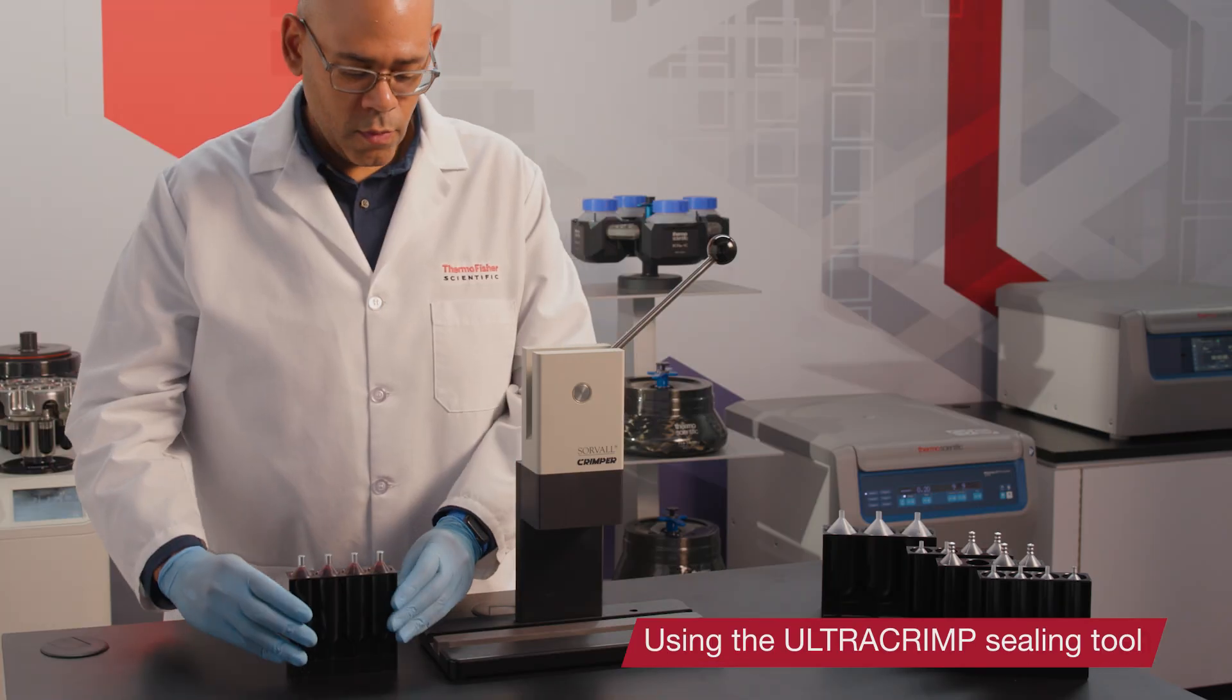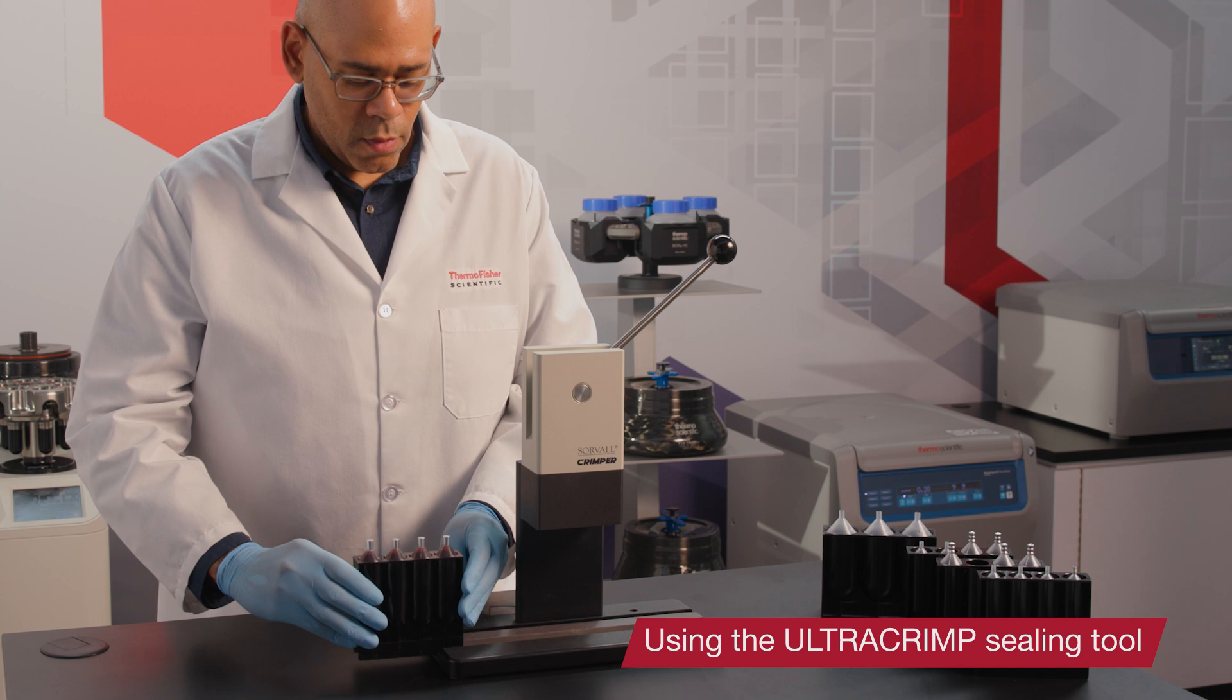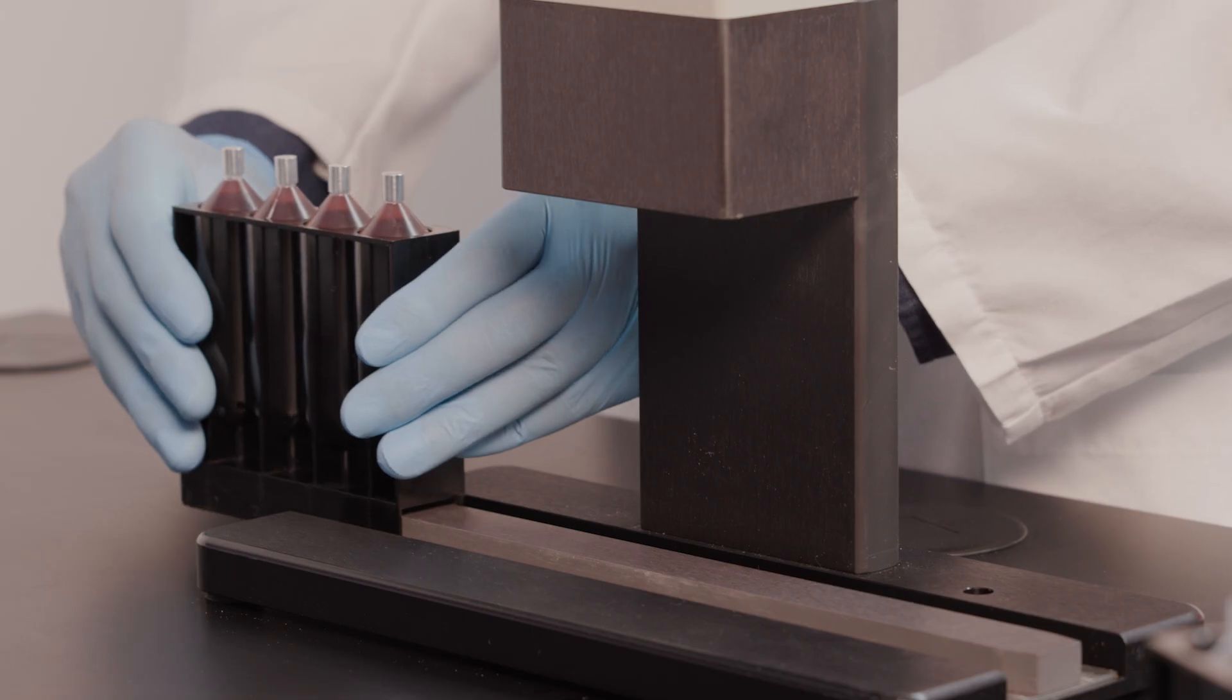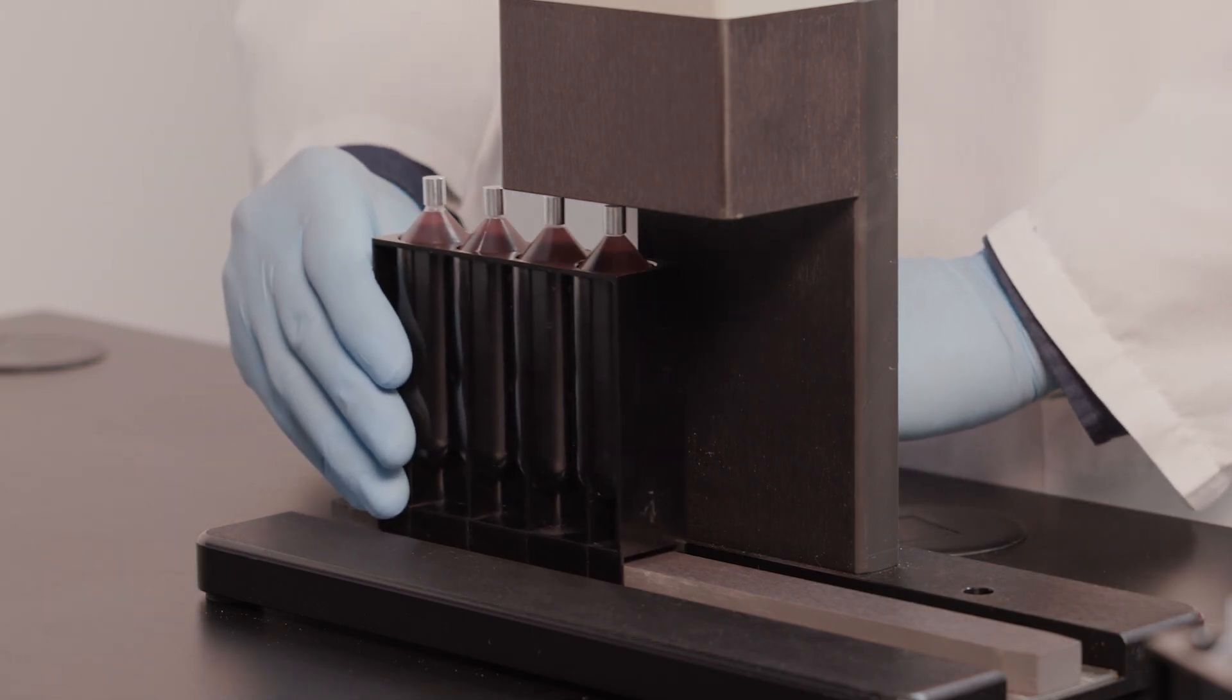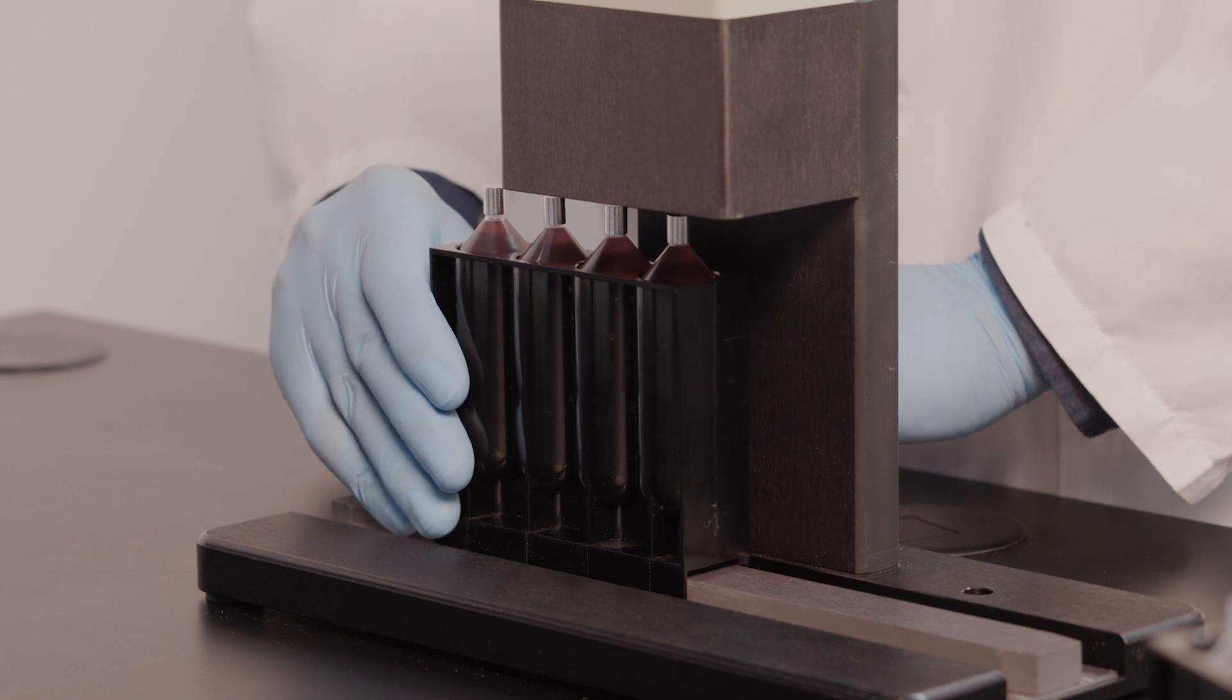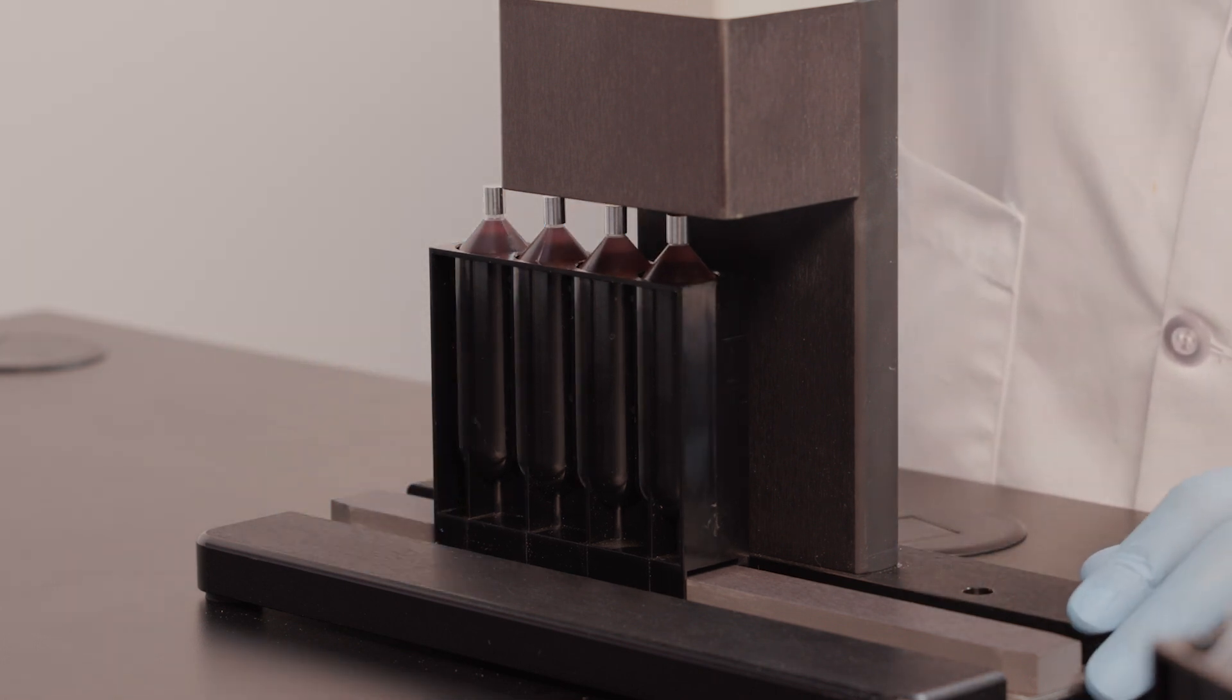Slide the tube rack into the ultracrimp sealing tool or crimper, placing the first tube directly under the crimping collet. The rack will click into place when it's in the proper position.